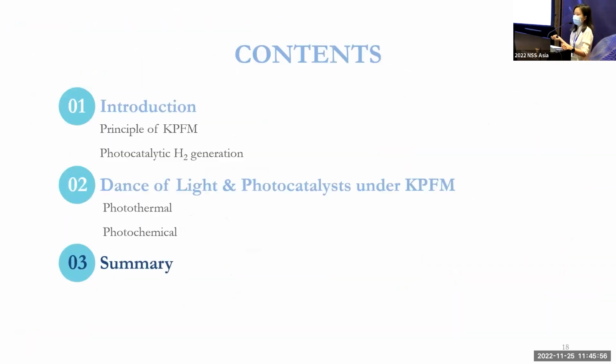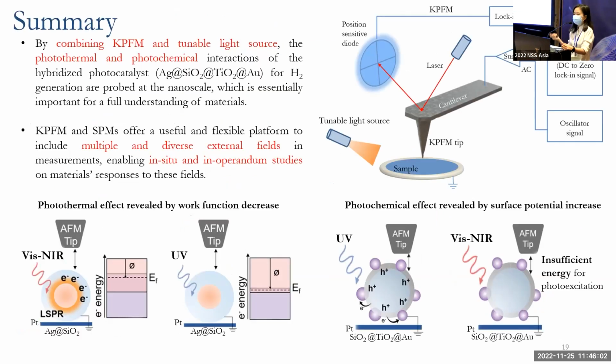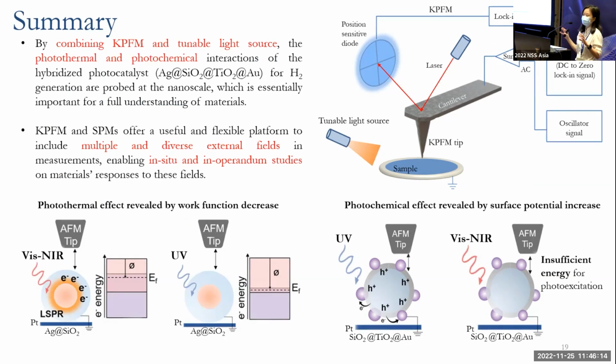Okay, now it's time for my summary. In this talk, we discussed the combination of KPFM and a tunable light source to study the photothermal and photochemical interaction between the light and the hybrid photocatalyst.